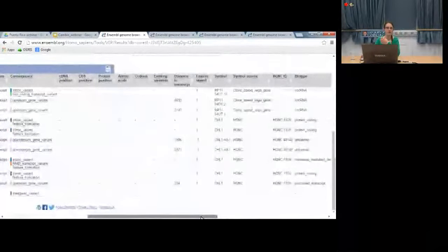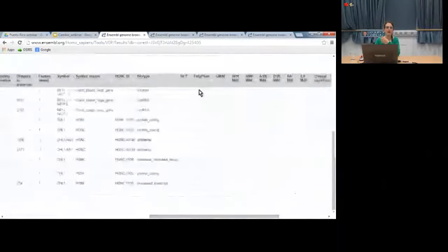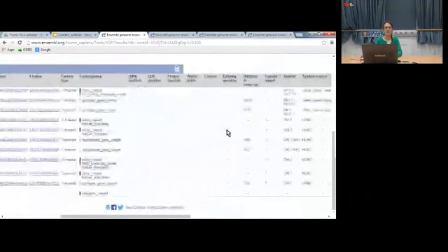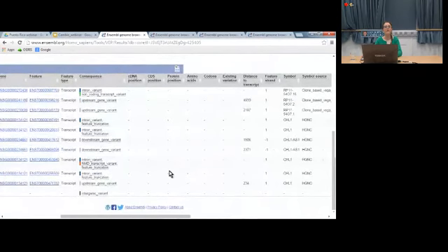Unfortunately, this example doesn't give me any missense variants, but if I had missense variants, I would have those SIFT and PolyPhen scores that I talked about earlier, which tell you how bad the change in the amino acid sequence is. It will work with variants that are not already known, and with variants that are already known as well. If they are already known, it will tell you in this column that your variants are known, and then it can give you information about them as well. So it's a really nice flexible tool that gives you lots of information.